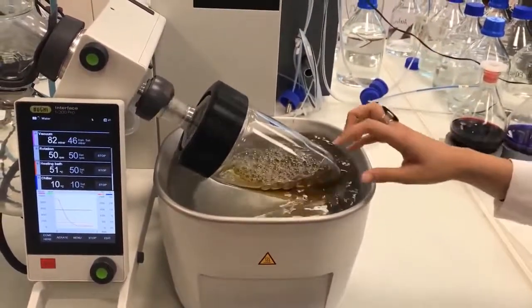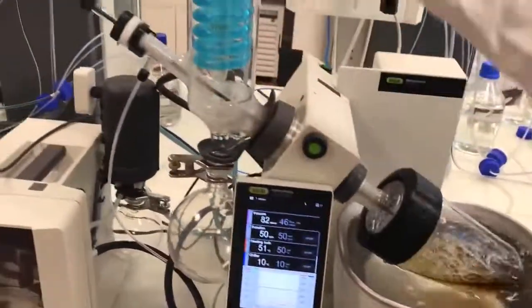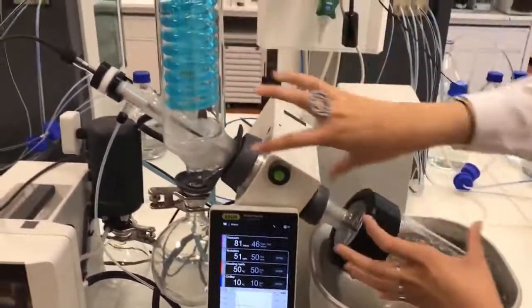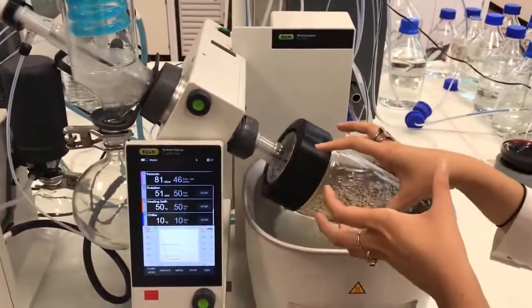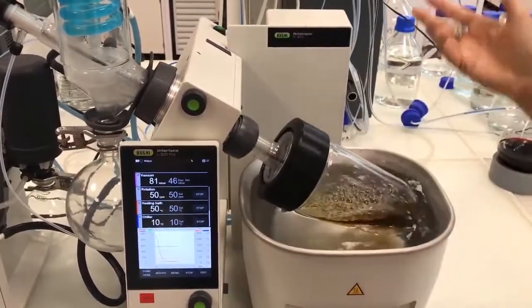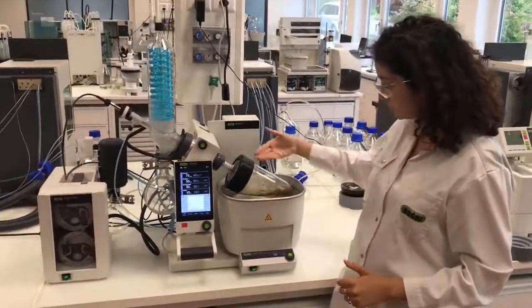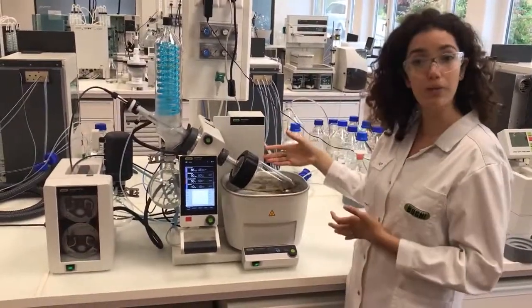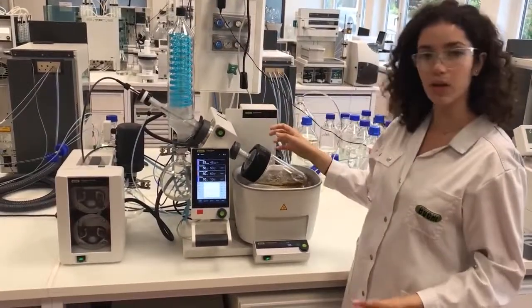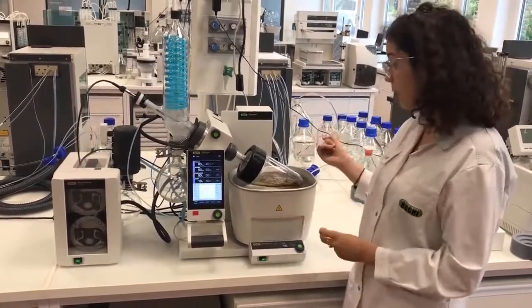So what's the point of that? Obviously, if you have foam starting here, the foam will just start going here and here and onto the condenser, which means that your sample will be spread all over the glassware of the rotary evaporator. If that happens, you will have to clean the entire system. So that's a bit of a hard task, let's say, to do. But if you have this foam sensor, it will automatically break the foam, so you won't have to think about it or to think about cleaning the condenser that often. It will do it automatically. So that's a really cool tool.